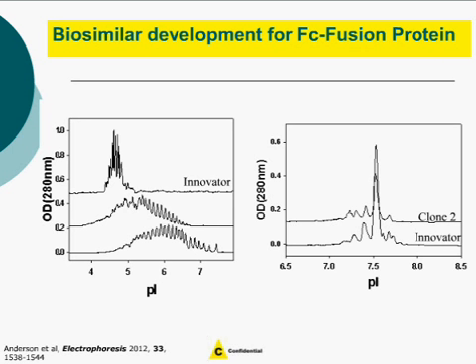During biosimilar product development, internal candidates are often compared with innovator products. This figure shows the electropherograms of 2 in-house strains compared to an innovator product. The protein contains 3 N-linked glycosylation sites and multiple O-linked glycosylation sites, in which the terminal end of the oligosaccharide has many sialic acids. This sialic acid distribution makes this glycoprotein very complex in terms of charge heterogeneity, which you can clearly see when you look at the electropherogram.